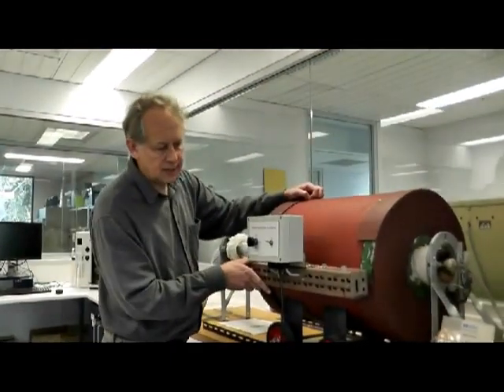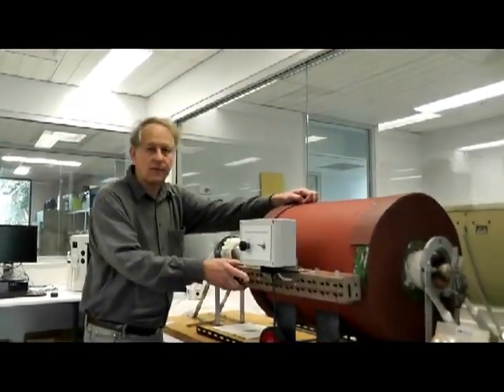Now this is an experimental test bed and it's manually operated at this stage.